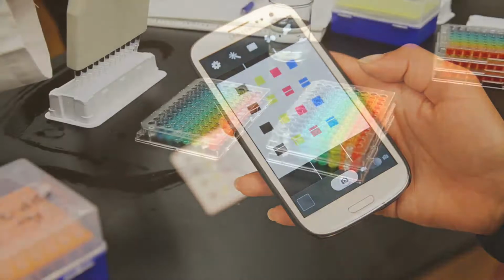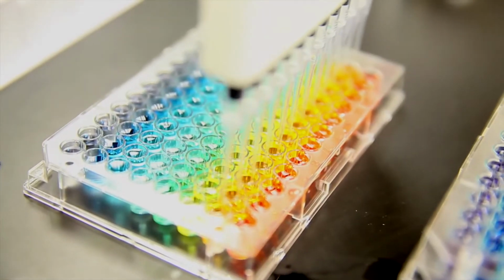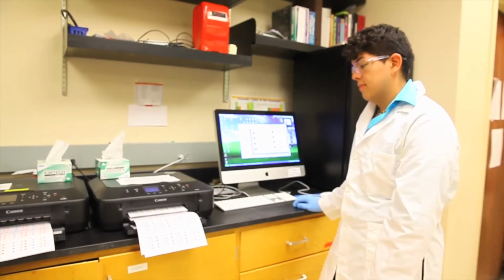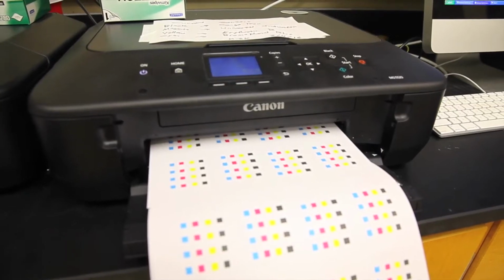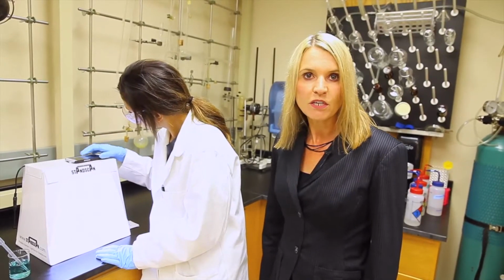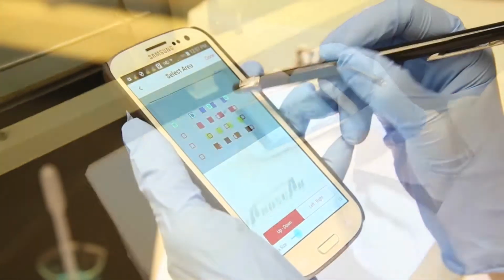Here you can see an example of our colorimetric sensors. As you can see, there are multiple sensors in a 96 well plate. Here you can see the simple inkjet printers that you can buy in any office supply store. And what we do is we take our sensors and we just print them with simple inkjet printing technology. We have developed smartphone applications for Android and iPhones. You can just use the camera, take a photo of the array, and analyze it with the smartphone app.